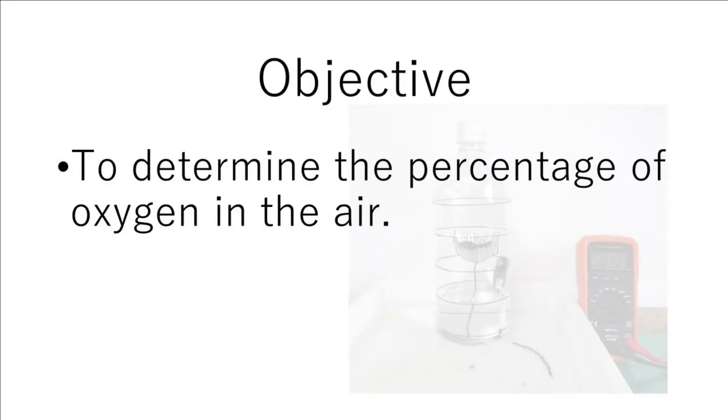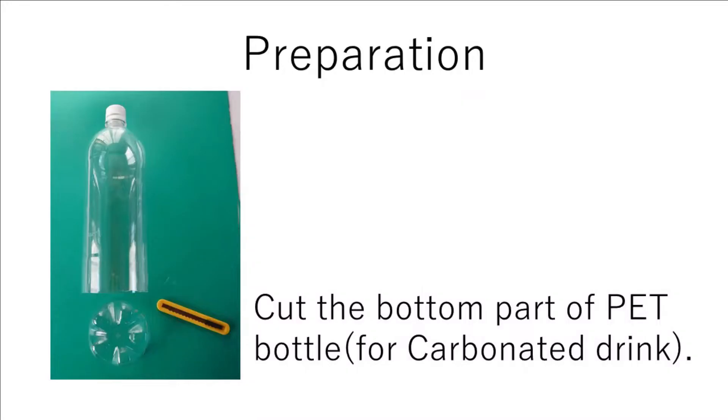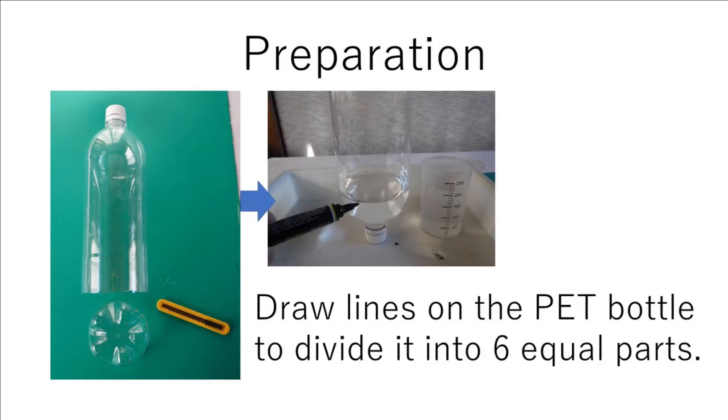The objective is to determine the percentage of oxygen in the air. For preparation, a pet bottle for carbonated drink is used as a gas jar. First, cut the bottom part of the pet bottle, then draw a line on the pet bottle to divide it into six equal parts.